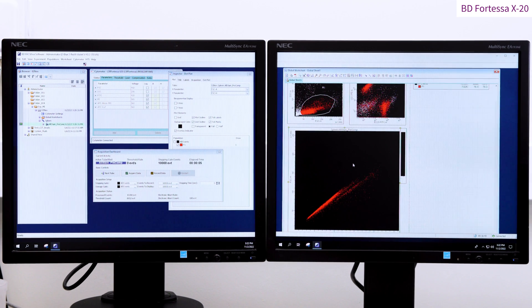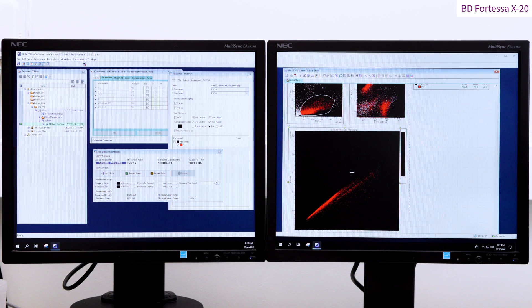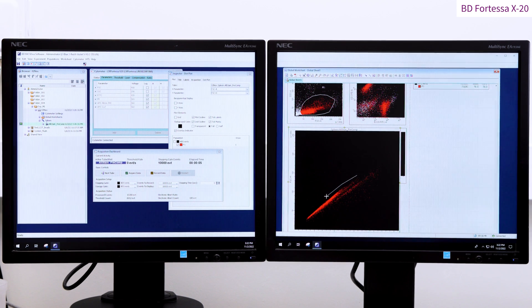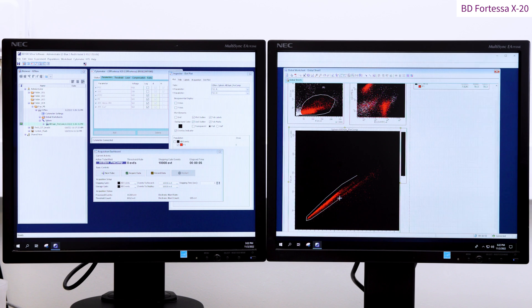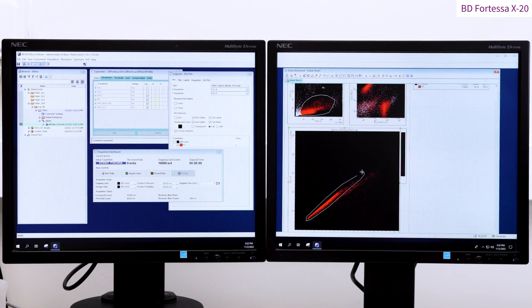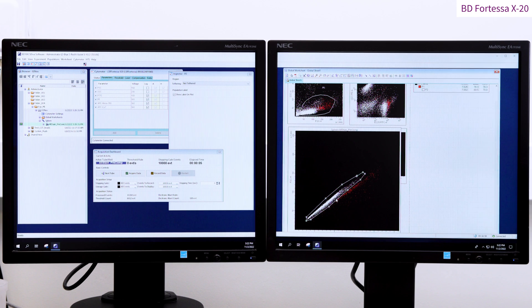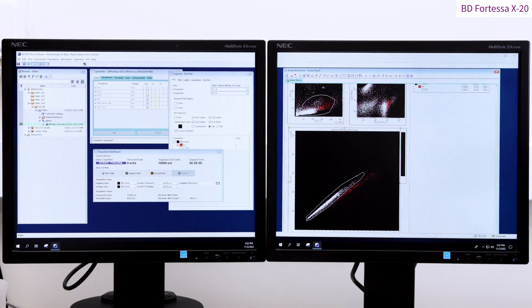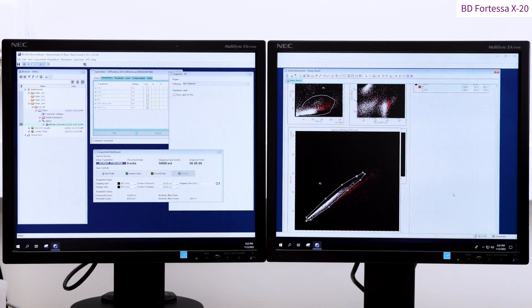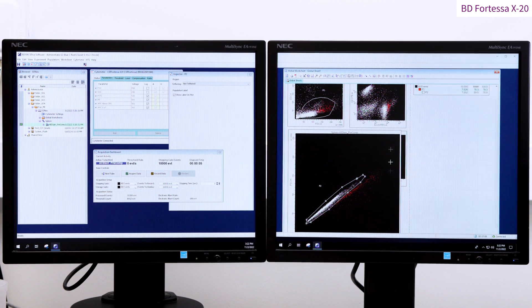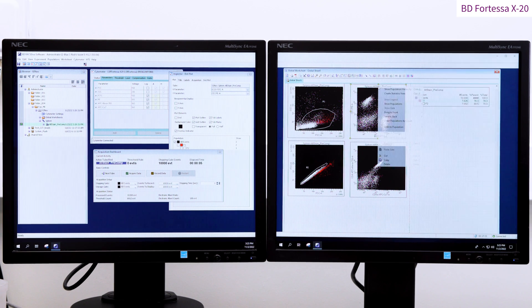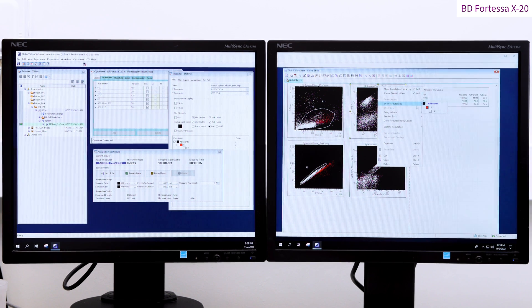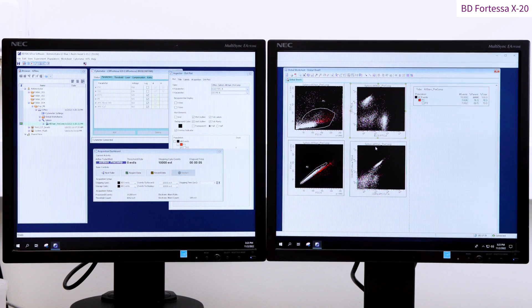Using the forward-scatter height and forward-scatter area dot plot, we can gate the singlets here in P2. By a right click, we can choose Show Population which applies P1 and P2 to our plots.